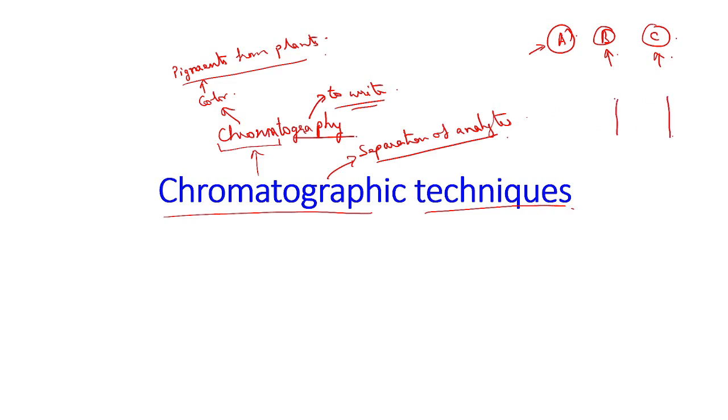Now you have thrown a party in your home. Suppose this is the home. So what is this basically? In terms of chromatographic technique, we call it the column. In the case of column chromatography, the casing or the home is regarded as the column. Within this column, you and your family members stay all throughout.